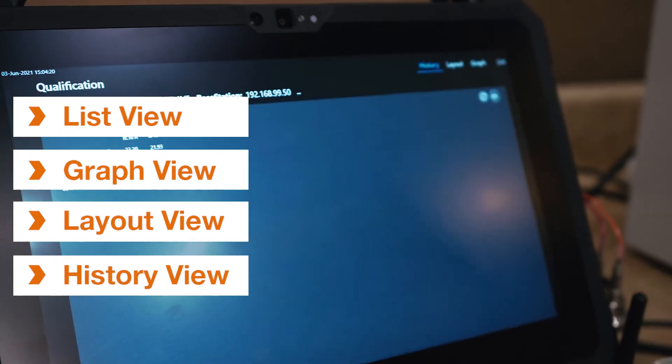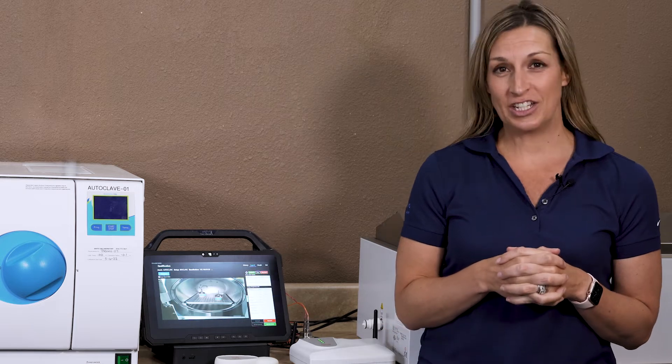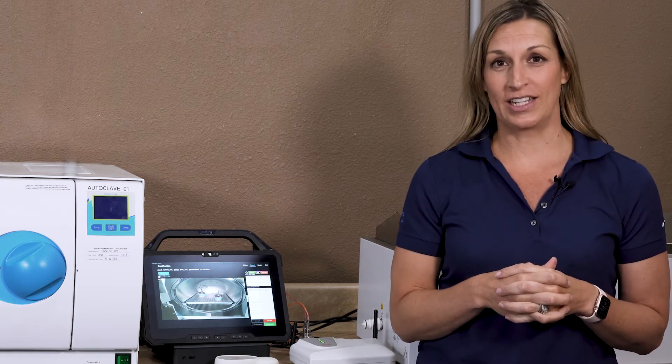You also have a history view, which is very nice. Overall, the validation console is very easy to use to operate your Kaye thermal validation equipment.